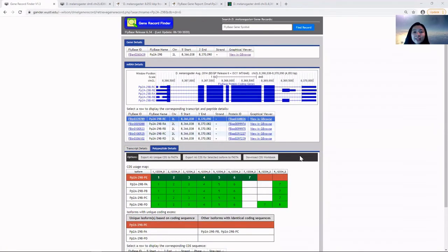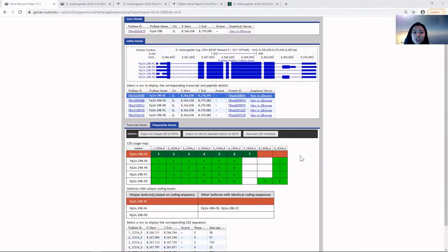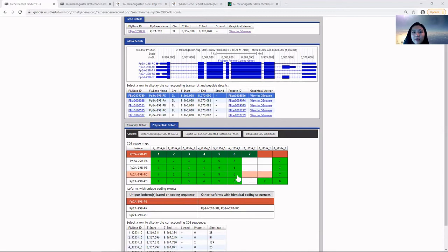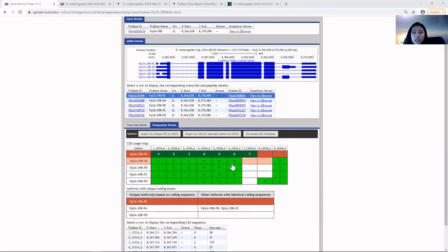Scrolling down to the CDS usage map section, we can observe the five isoforms. They have six identical coding exons in common, between exon one through six, shown in the green box.